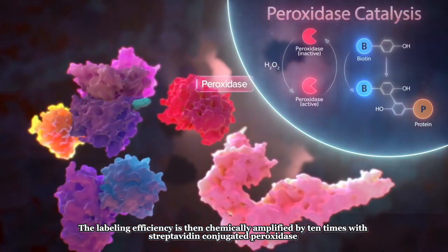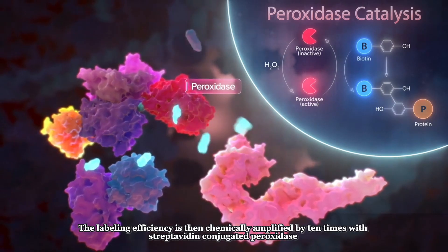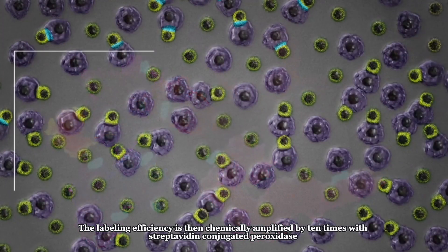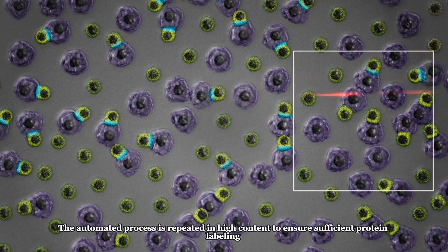The labeling efficiency is then chemically amplified by 10 times with streptavidin-conjugated peroxidase. The automated process is repeated in high content to ensure sufficient protein labeling.